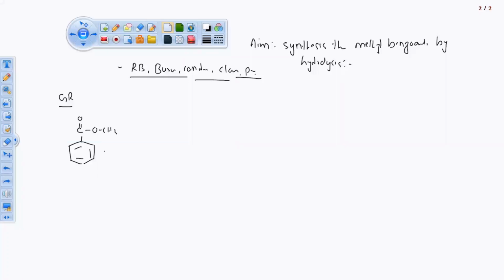Okay. So this methyl benzoate, we are converting into salt form by using sodium hydroxide and then hydrochloric acid. With this hydrolysis process we are going to get the benzoic acid. So in this reaction condition, we have to use the methyl benzoate and add the sodium hydroxide to that. Then in presence of hydrochloric acid, we are going to get the benzoic acid.